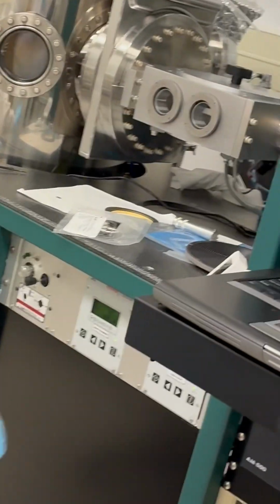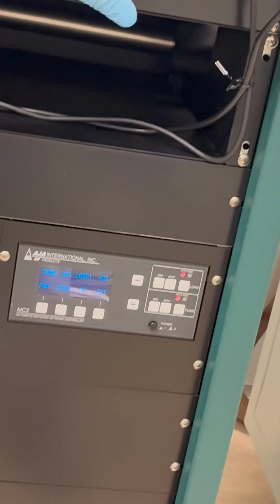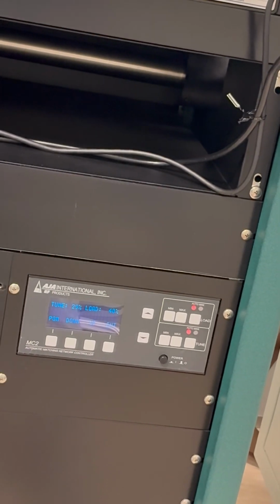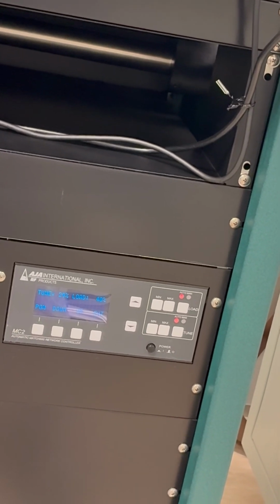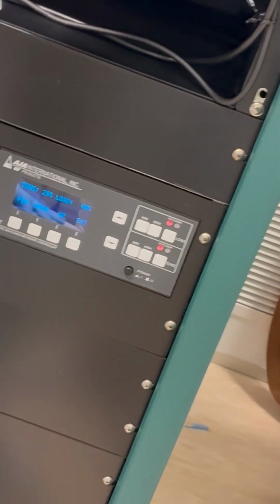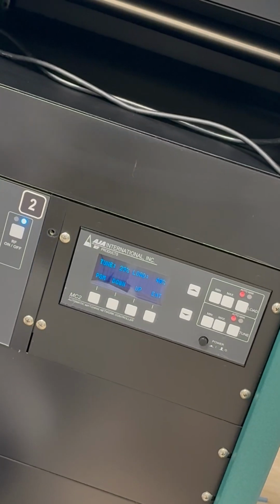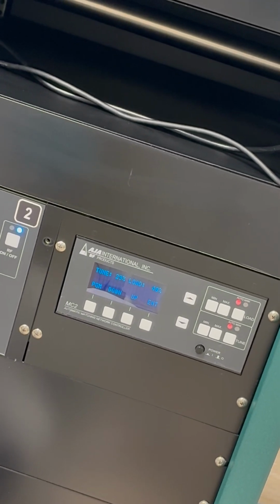And the reason why I'm doing that is because this number right here, which I'm basing everything off of, can only change when it ticks up to the next one. Once this goes from 243.5 to 243.6, it's going to tick up and it's going to say 7.